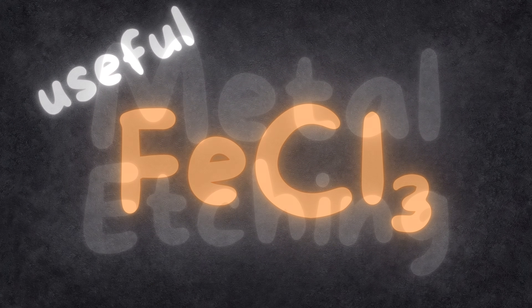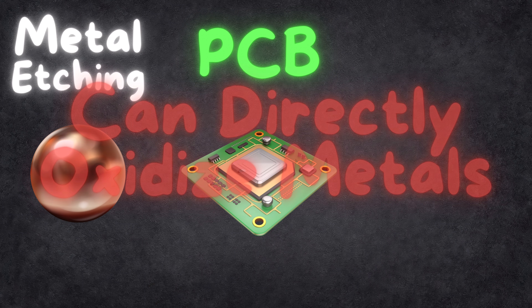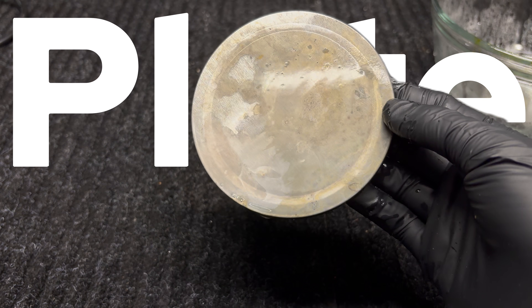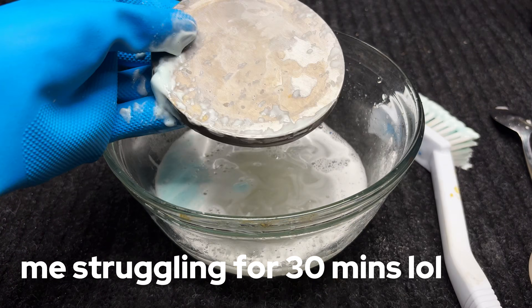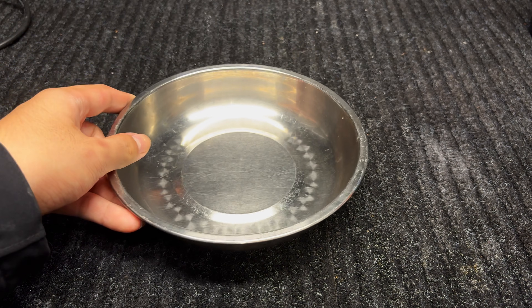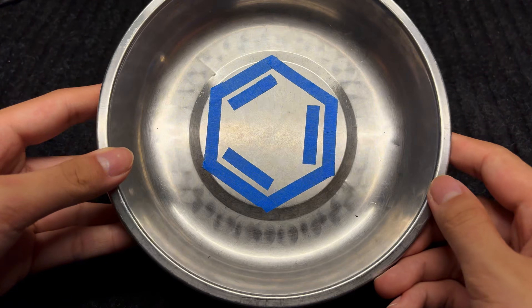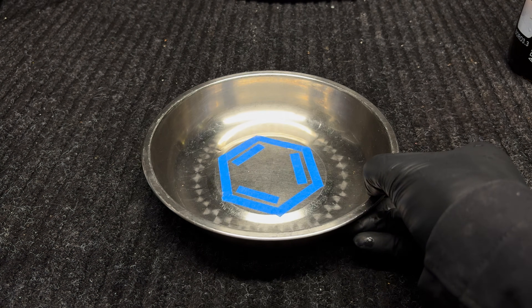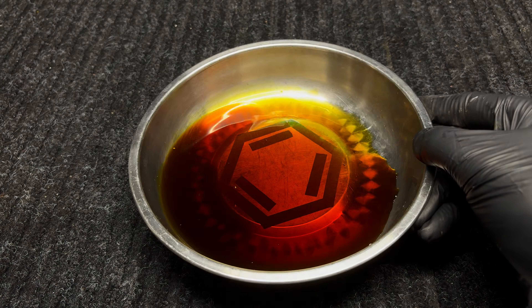Step 8: etching. One reason ferric chloride is so useful is its industrial use in metal etching, specifically copper — it is a crucial part of the PCB industry. As a common etchant, it is relatively safe and unique due to its ability to directly oxidize metals. I decided to try it out on a round stainless steel plate. I taped a benzene ring shape onto the plate, poured in some ferric chloride solution — the exposed metal should be etched while the tape-covered parts remain untouched. It may take a while since ferric chloride isn't the best at etching steel, so I set it aside and moved on.